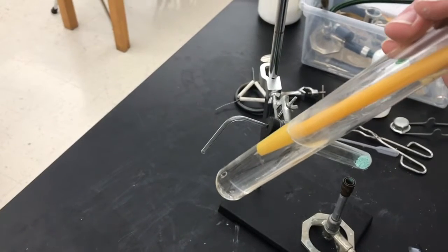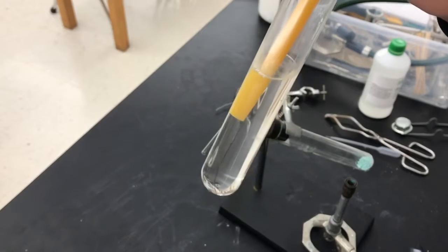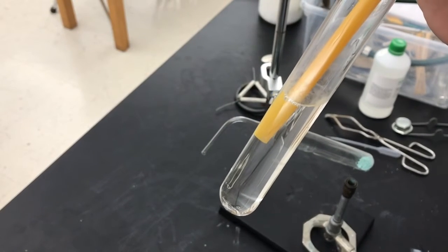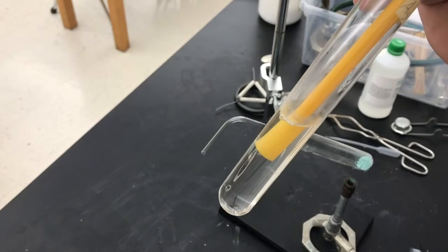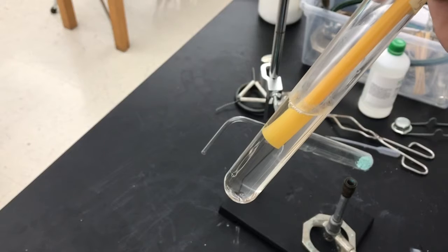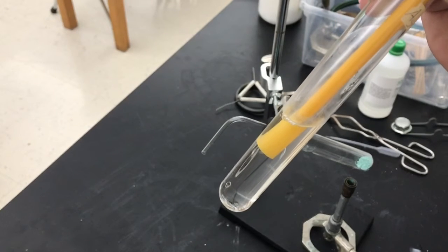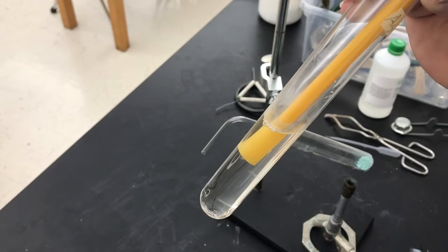Another way to test for carbon dioxide is to use what's called lime water. And in this test tube, I have some lime water. Lime water is a solution of calcium hydroxide, and when it comes in contact with carbon dioxide gas, a precipitate forms, a cloudiness forms, which shows the presence of carbon dioxide.